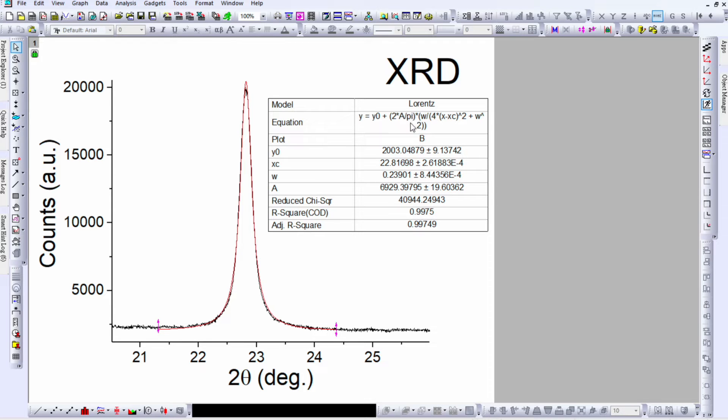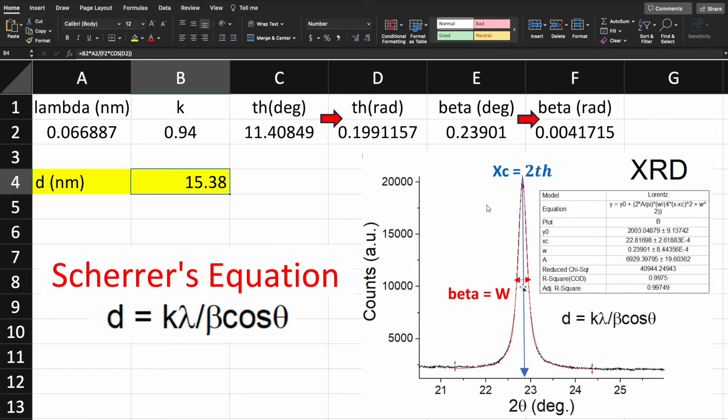By using Lorentzian function through fitting, I got the peak center and full width half maxima. If you want to learn how to perform fitting you can watch my previous video. After fitting we got the full width half maxima which is beta and the peak center which is 2 theta.